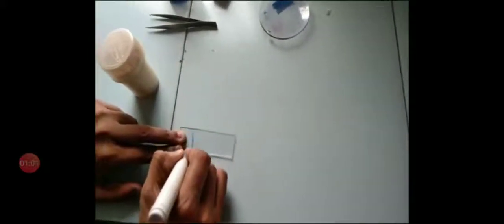Now in order to observe human cheek cells under a compound microscope, we need a watch glass, glass slide, toothpick, forceps, methylene blue solution, cover slip. And lastly, we are going to use a compound microscope. Now with the help of a marker, we are going to mark it on a glass slide. And we are going to turn it.